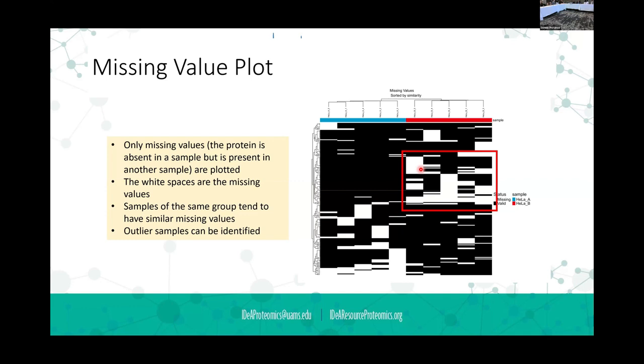If that small signal were present 10 minutes earlier in the chromatogram, there are just too many peptides that are not quite at the detection limit, but the summed intensity of those causes more noise in the spectrum. And so it's more of a signal to noise issue than a signal issue.